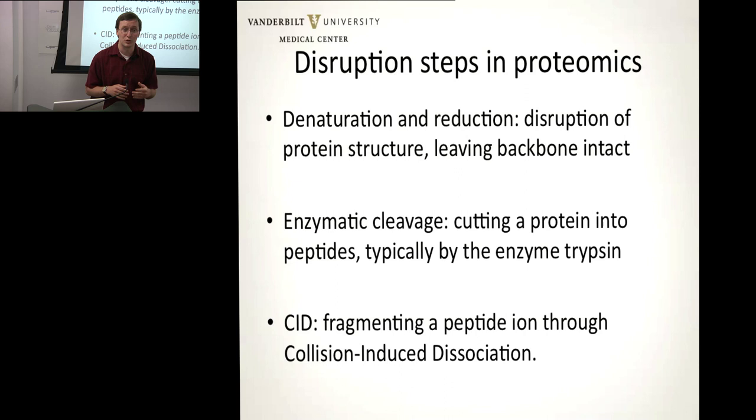The next stage, though, is kind of the counterintuitive step. Imagine that you have 1,000 different proteins in a mixture. The first step then that we take towards the proteome is to digest them up. Well, that seems sort of counterintuitive because we've taken a mixture of 1,000 proteins and turned it into 10,000 peptides.